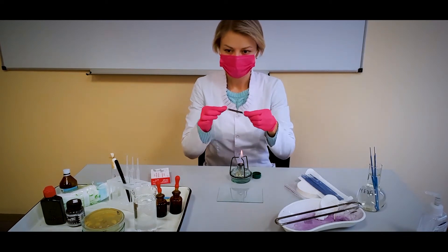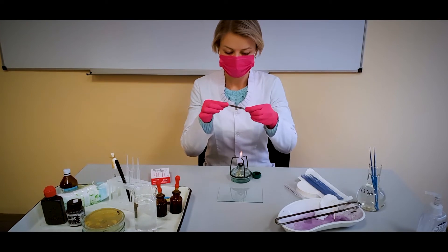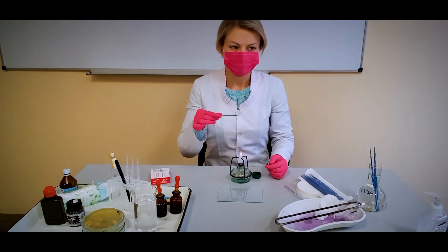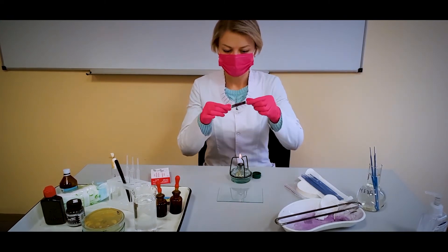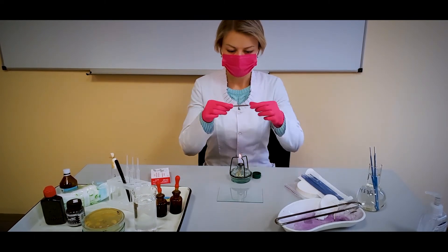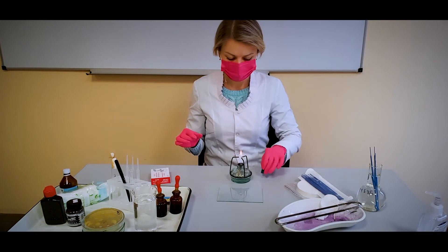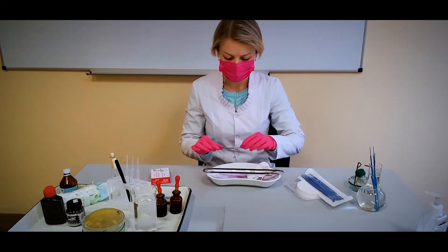Allow the smear to air dry. In a practical lesson, to save time, you can dry it over the fire of an alcohol burner lamp. After that, the smear is fixed in a chemical way with a Nikiforov mixture or other mixtures, especially if the culture has a protein capsule. In this video, I will fix the smear thermally, which is used less often for those bacteria whose capsule consists of polysaccharides.